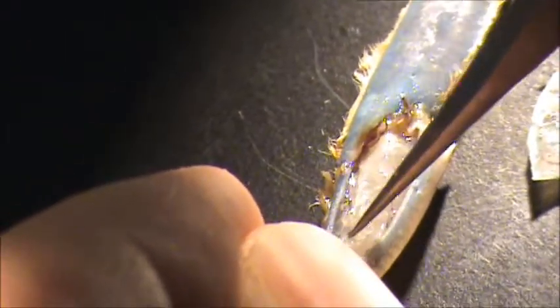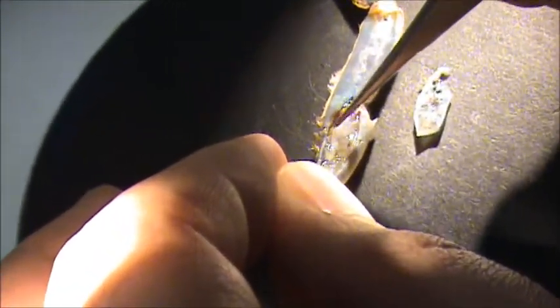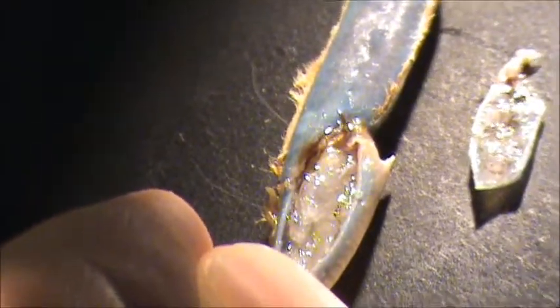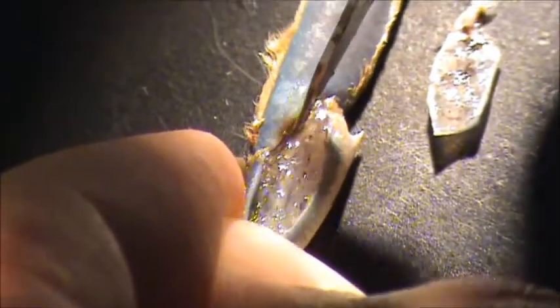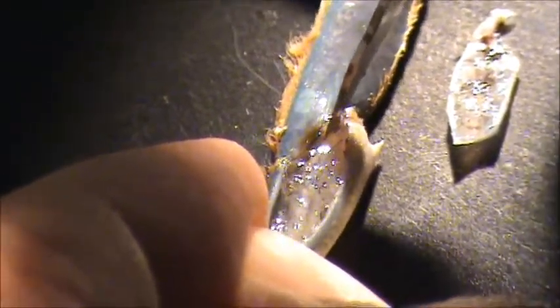Then, as I mentioned before, this part is a bender muscle. Then we don't need the bender muscle. You see that this white structure is a tendon. We should cut the tendon here with the blade number 11 and cut it like this. And after that you can remove it like this.